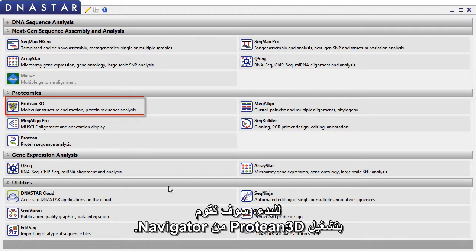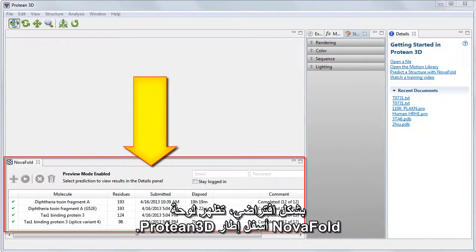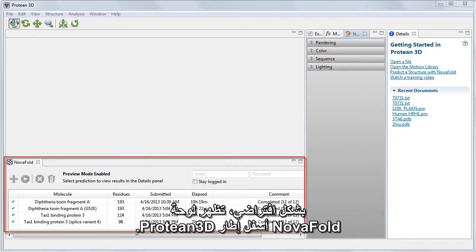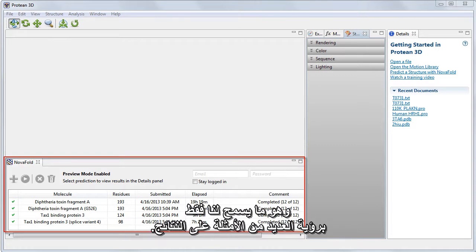To get started, we'll launch Protean 3D from the Navigator. By default, the NovaFold panel appears at the bottom left of the Protean 3D window. Since we are not logged in, the NovaFold panel is in preview mode, which only allows us to see several example results.